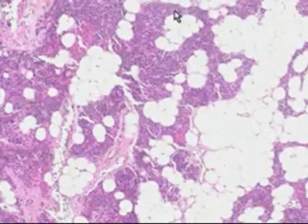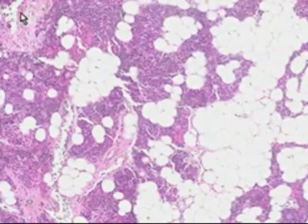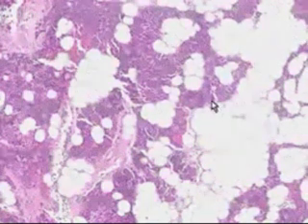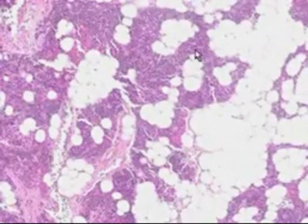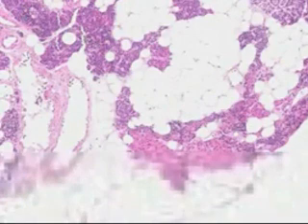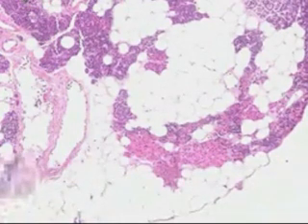The parathyroid gland, besides having a nice fibrous capsule, which you can see here, and a little bit of fibrous tissue like you see here, and fat and blood vessels, has two kinds of cells. The cells that you see chiefly are called chief cells. And all of these cells here look like endocrine cells, perhaps sometimes looking like they form little follicles, but the chief cell of the parathyroid is the chief cell.